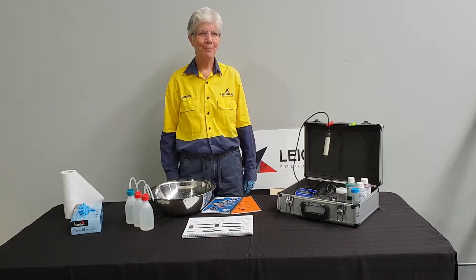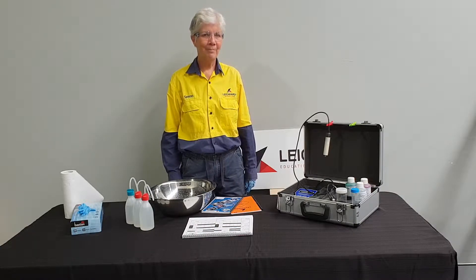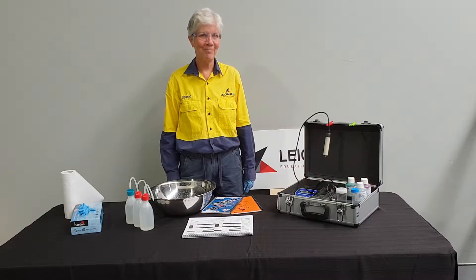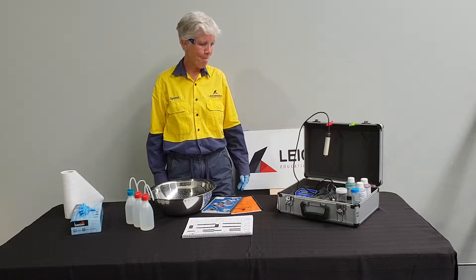In this video we will demonstrate how to calibrate the WP81 meter for conductivity. Before we start, Serena will show you the equipment needed to perform the calibration.